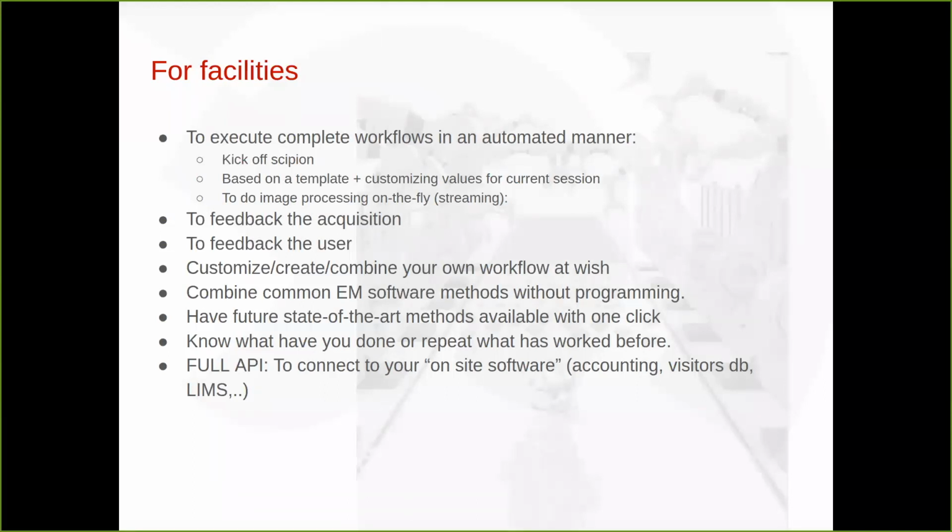And another point, you might have an accounting system or a visitors database to manage your visits, or maybe you have a LIMS system. Scipion has a full Python API, and it can connect or be connected programmatically. It has already been done in different facilities, and it has worked nicely to send data or even kick off a Scipion from another application.